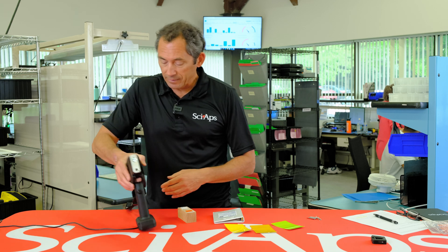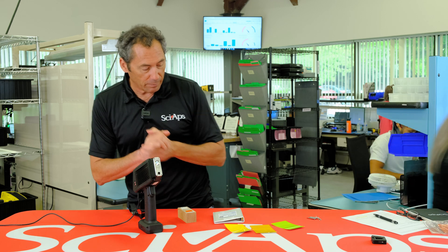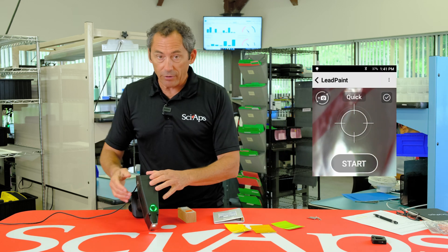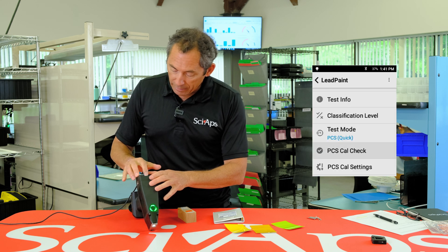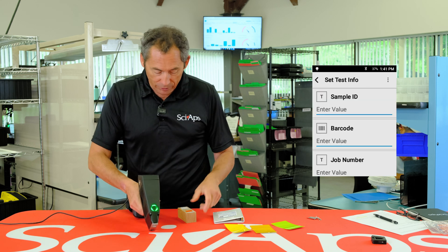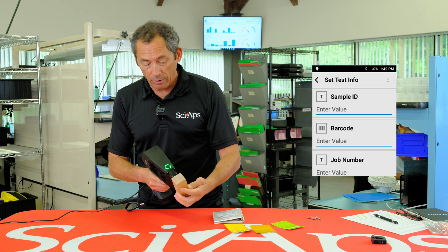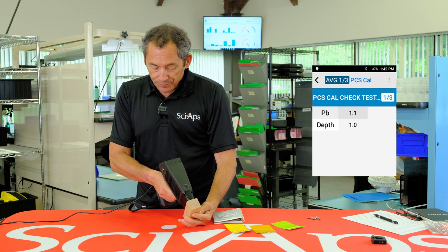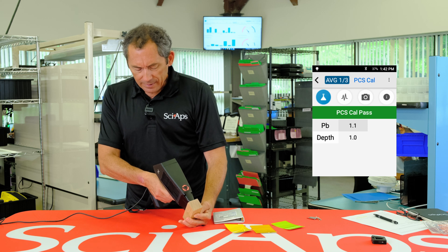So that's the model and what it does. Let's give you a quick tour of this device before we talk about the technology. The first thing that happens is you turn it on, and it automatically forces you to do a PCS cal check. You take your NIST 1.04 standard, put the device on it, and on the screen it says PCS cal pass.